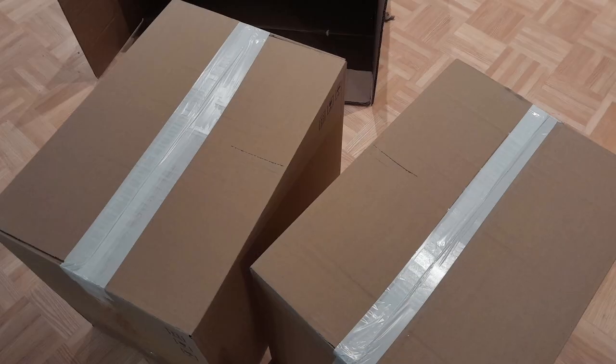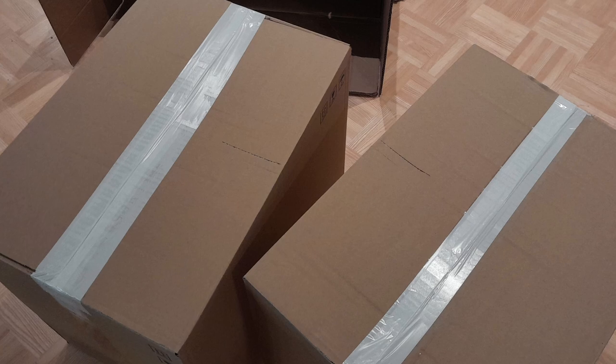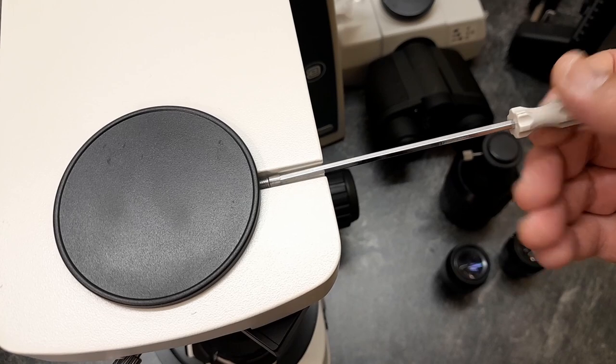But today I'm going to have a specific look at this one over here. Now, I'm going to divide this video into several parts. First of all, I'll be unboxing the microscope. Then, of course, I have to assemble it and put it together. There's not a lot of assembly required, but a little bit. Then, of course, we're going to have a more detailed look at the different features that the microscope has to offer. And then last but not least, of course, I will be putting a few specimen slides under the microscope. But as a matter of fact, one of the slides you are already able to see, this here is a cross-section of wood. So I would say let's unbox the microscope.